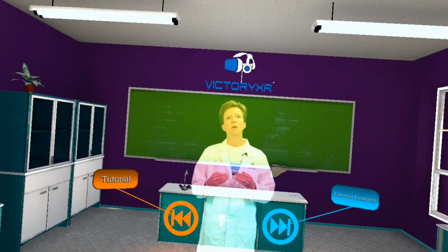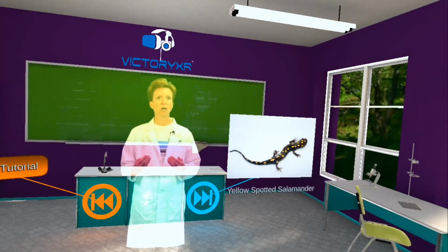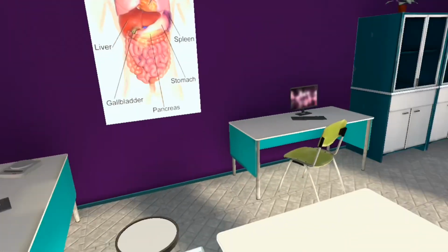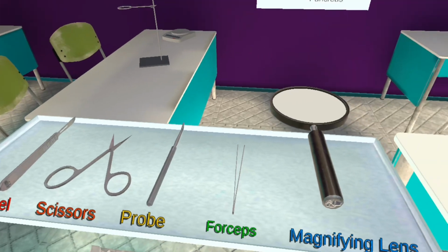She's very flat. Now, Anura means without a tail. Don't mean that in a rude way. Adult frogs and toads, unlike other amphibians like salamanders, for example, are tailless. Amphibians live on both land and water. Amphibian actually means double life.